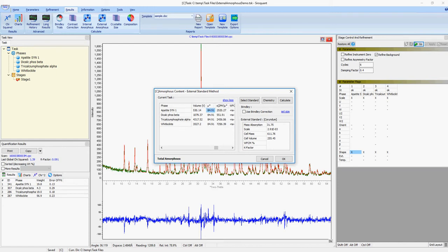You'll see that the mass absorption coefficient is automatically copied to the other phases as it is for the entire sample.